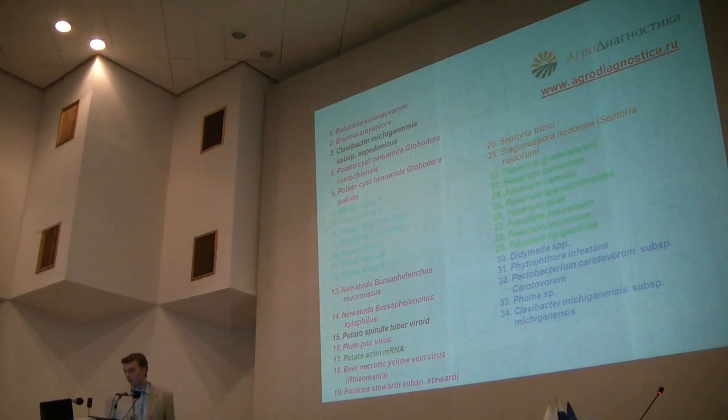And also we describe control systems of potato actin mRNA sequences for checking the quality of PCR.